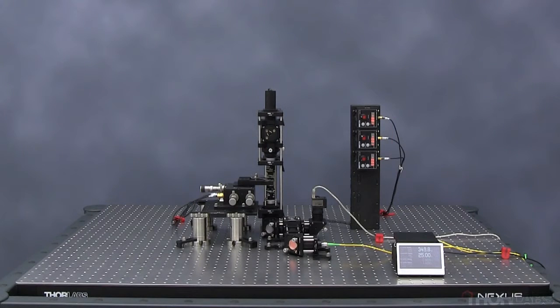Thorlabs' OTKB modular optical tweezers system is designed as a complete optical trapping system for the capture and manipulation of microscopic sized objects. The modular design allows the optical trap to be easily modified to add functionality.